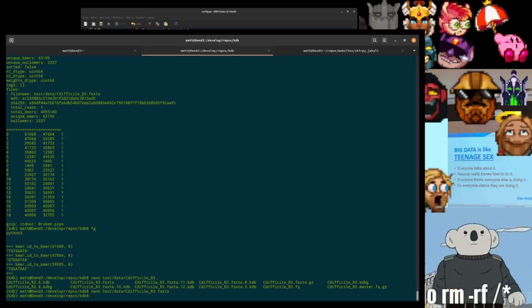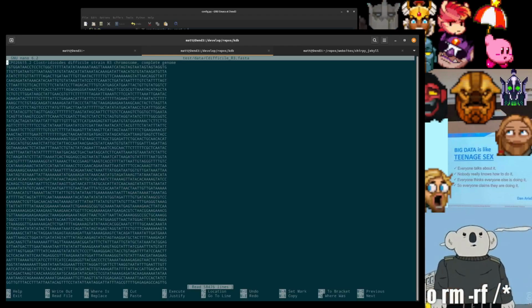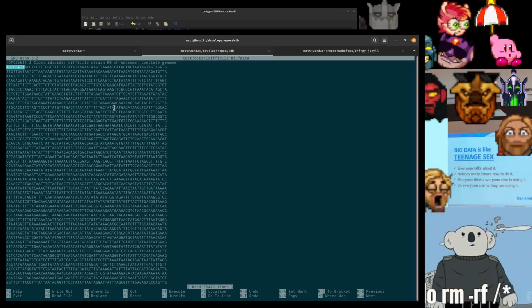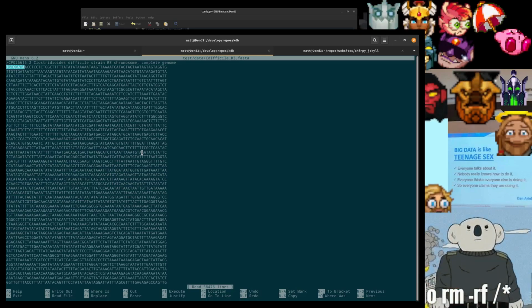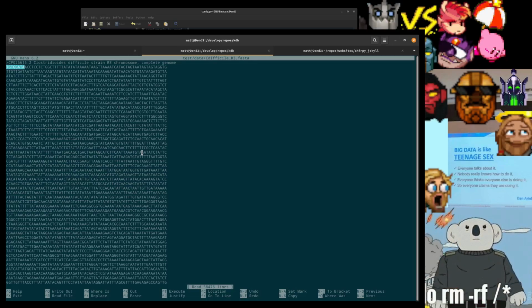Okay? That was pretty quick, so let me mouse over it one more time. Okay? So the Clostridioides difficile R3 genome starts with the sequence that we claim that it is.